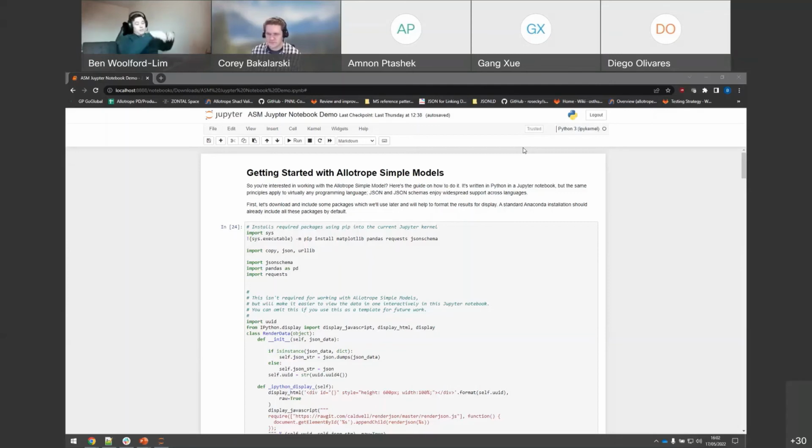So we have GitLab, we have Perl and subfolders, and then we have a test folder. Underneath that, you'll have the specific techniques: chromatography, conductivity, blood gas analysis, and so forth. And then underneath that, the different maturity levels. Always go for the newest maturity level, obviously, because you're getting the very latest version.